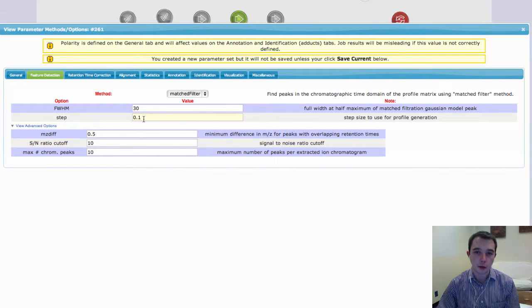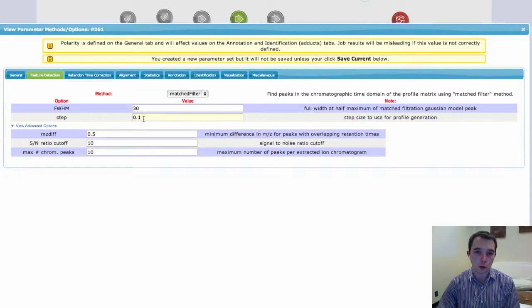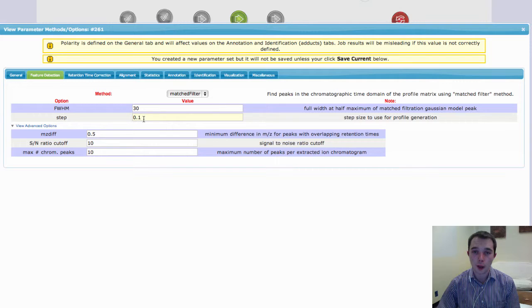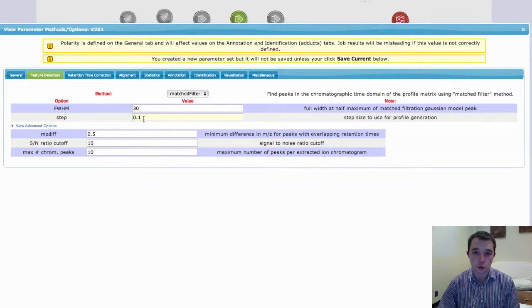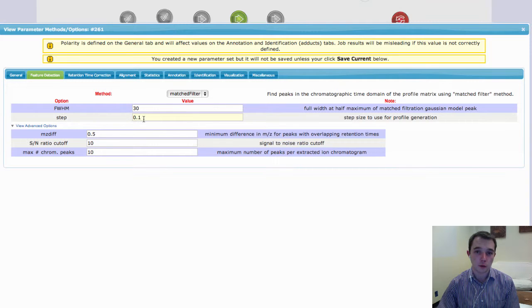Now, in low resolution data, 0.1 is quite good. And what 0.1 corresponds to is 0.1 m over z, or your mass to charge ratio bins. So we're going to bin up the data into 0.1 units.